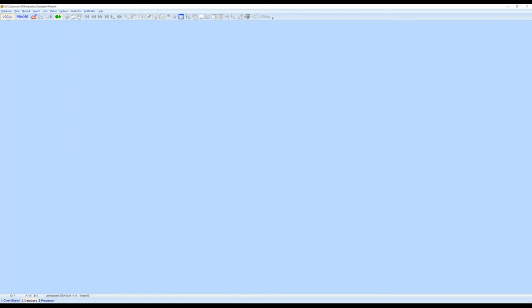This can be either a local database, that is a database stored on your computer in a flat file, or it can be a remote database, meaning a database that is hosted with an enterprise database server, Oracle or Postgres. So if I click remote here, it's giving me a window to log into the database server, and you need to provide the host name, the username, and the password. I'm not going to do a remote database today. I'm going to do a local database. The functionality is similar for what we want to see.